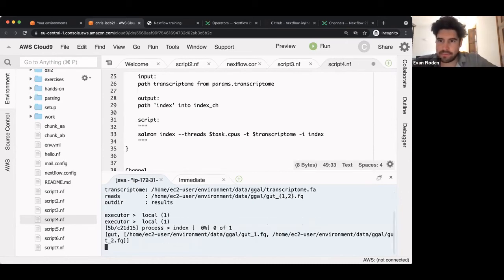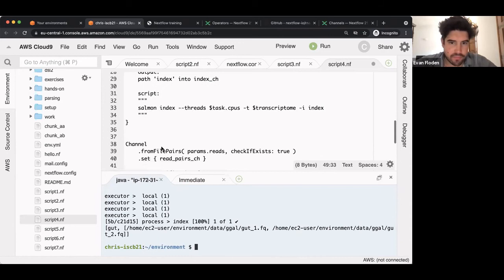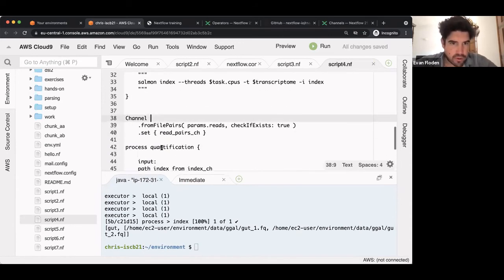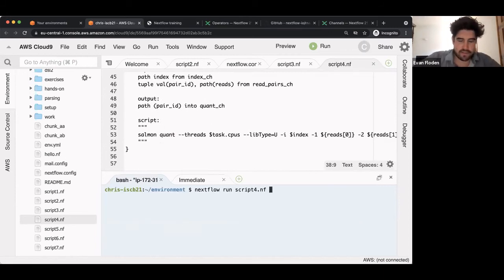Okay, and you can see it's printed to the screen here. I left something in there. I'm not sure if I saved that completely. That doesn't look right. Let's try it again. I don't think I saved the script before I launched that.